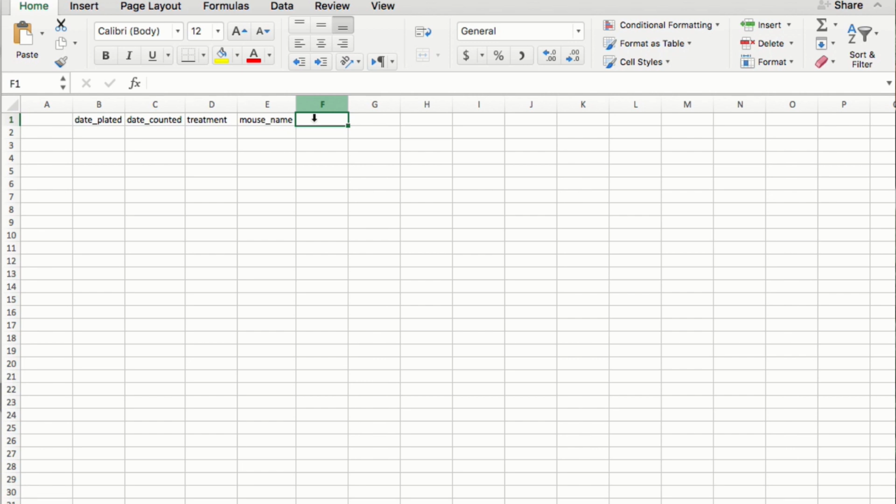In the previous video, we talked about how certain numbers of colony-forming units are ideal. You want them to be within a countable range. And if we pull out a plate and we go, hey, it's not countable, well, it might be useful to keep track of that. Was it countable or not? Could be one of our values. And then finally, the thing that you probably originally were thinking would be the first thing in the spreadsheet, which is colony-forming units. How many colony-forming units were on the plate?